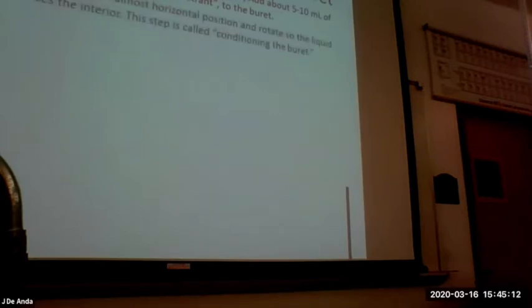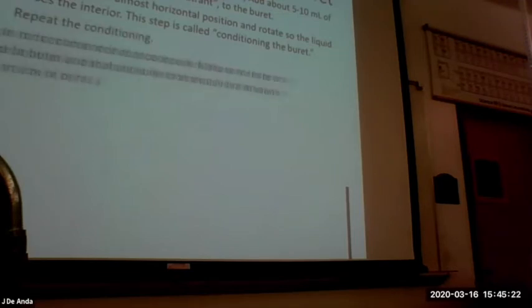Then tilt the burette to an almost horizontal position, rotate it to rinse the interior. This is what's called conditioning the burette. It says here to repeat it. I don't think you need to repeat it. One time should be enough, all right?